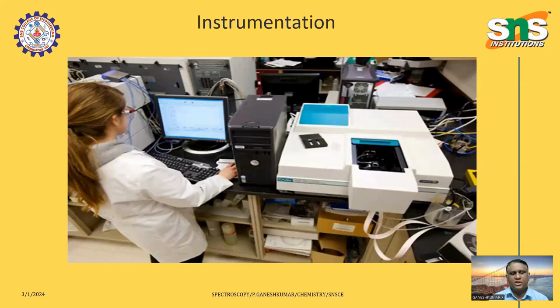So this is a typical picture of the UV spectroscopy connected to a software. Once the analysis is done, they will get a software reading as a notepad.